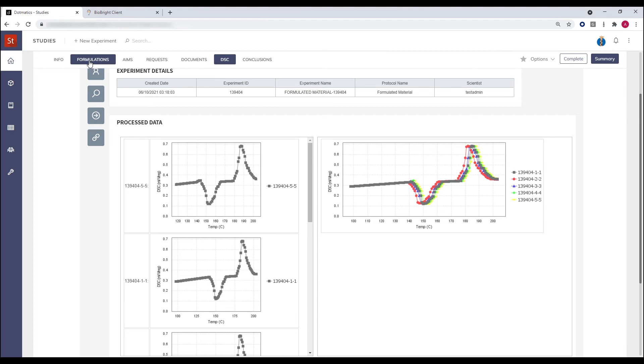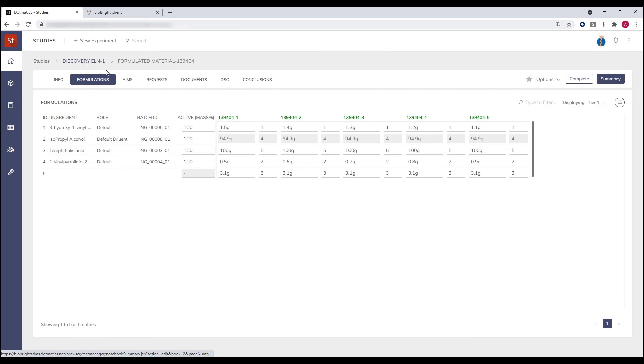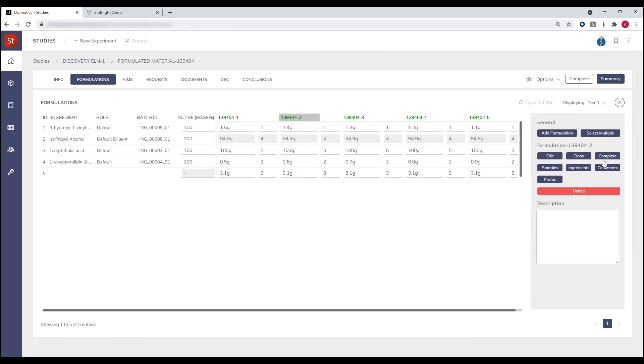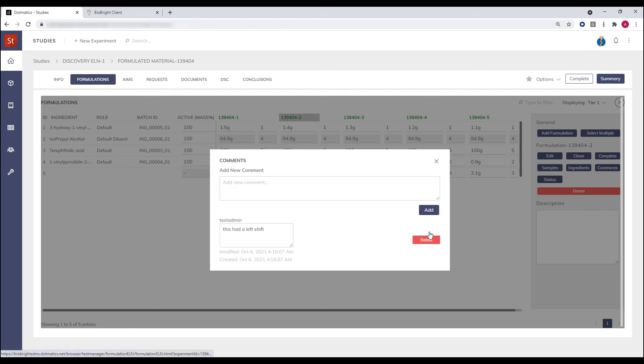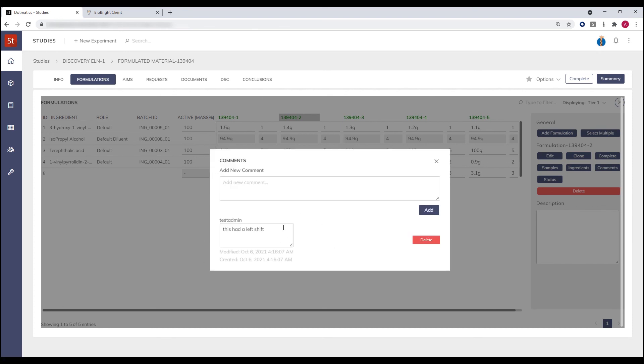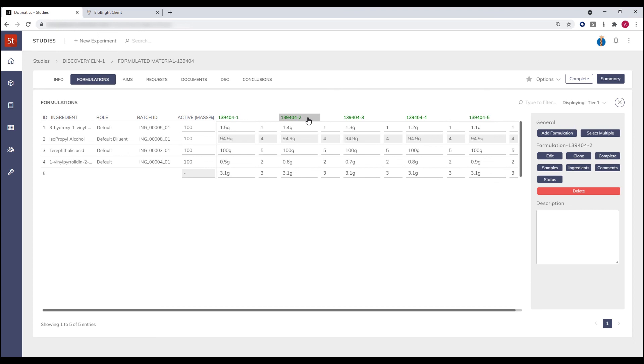So in this case, I can take a step to the formulations tab, select formulation two, and then I can make comments to allow auditing of this information and allow perhaps completion and closure of a given sample.